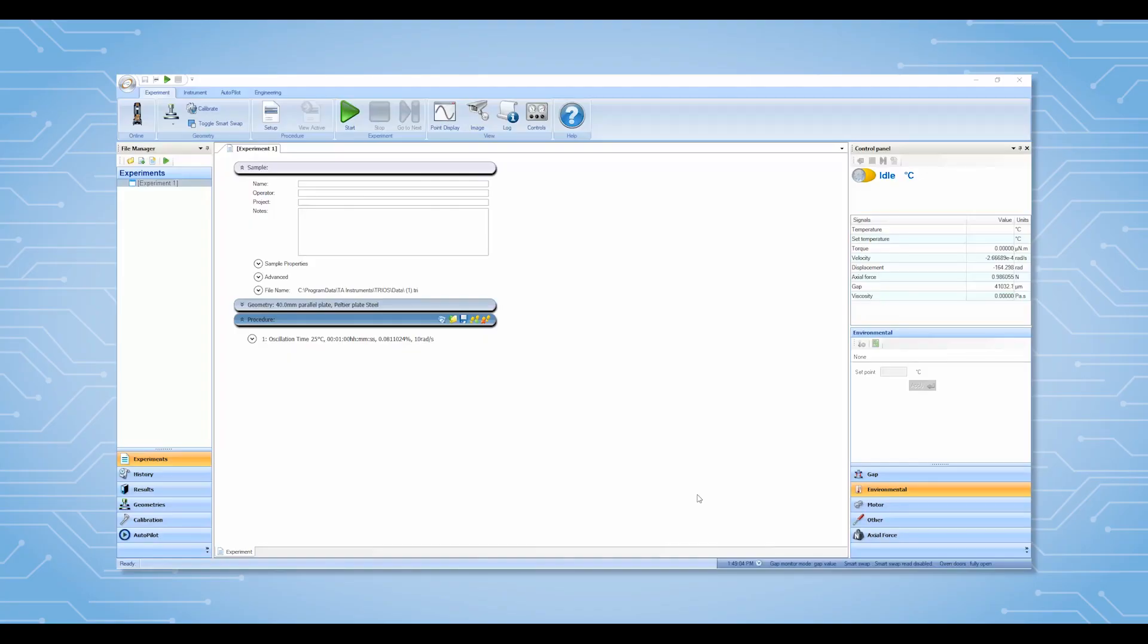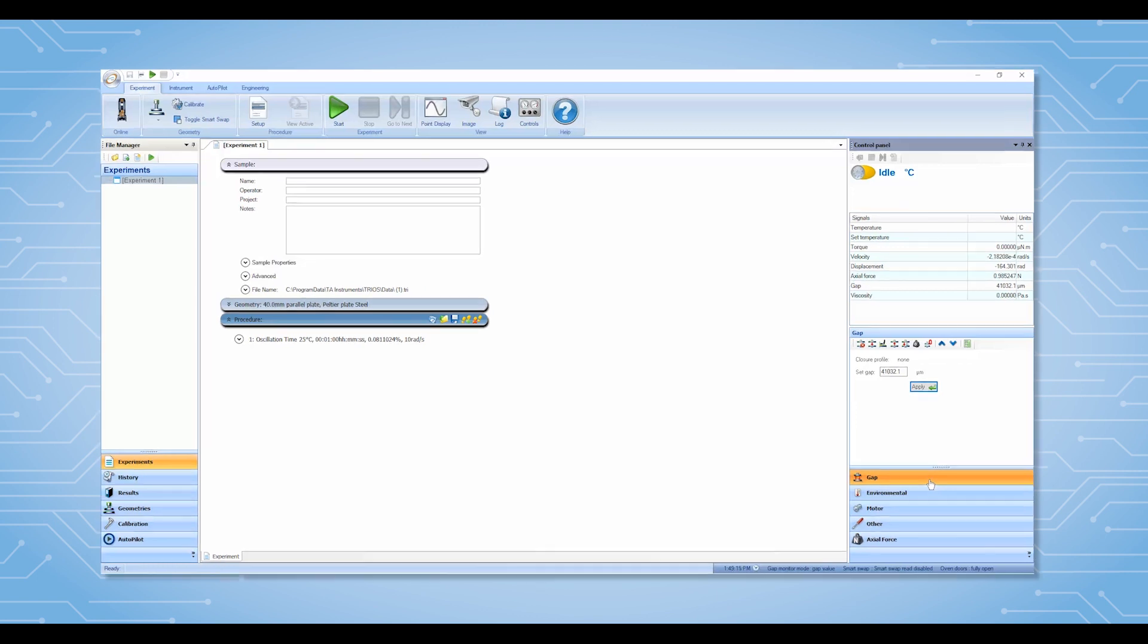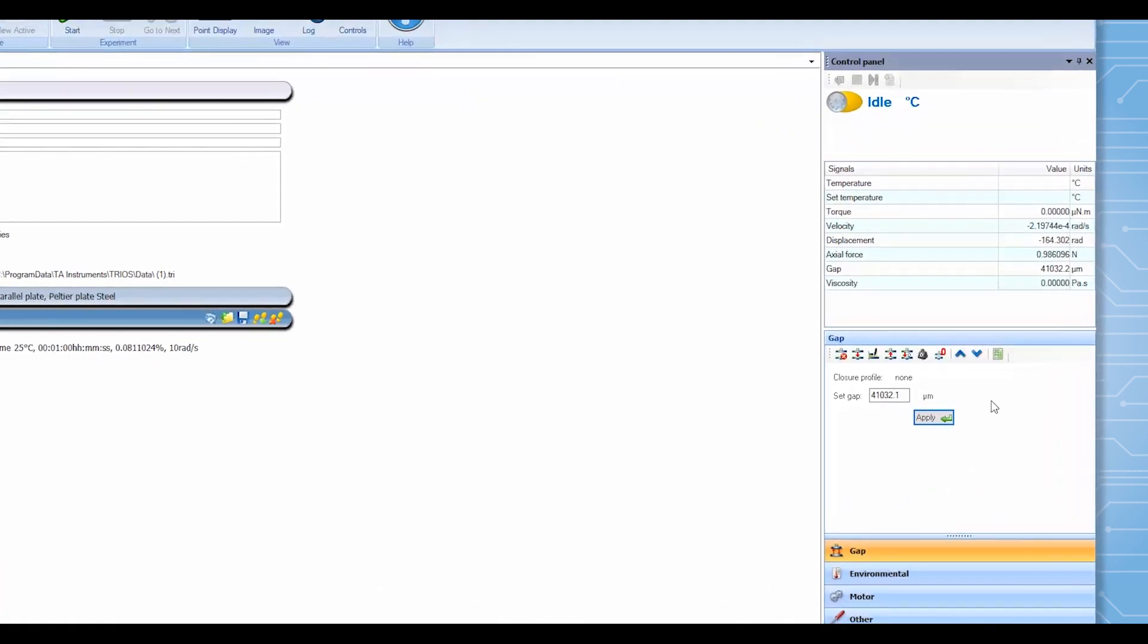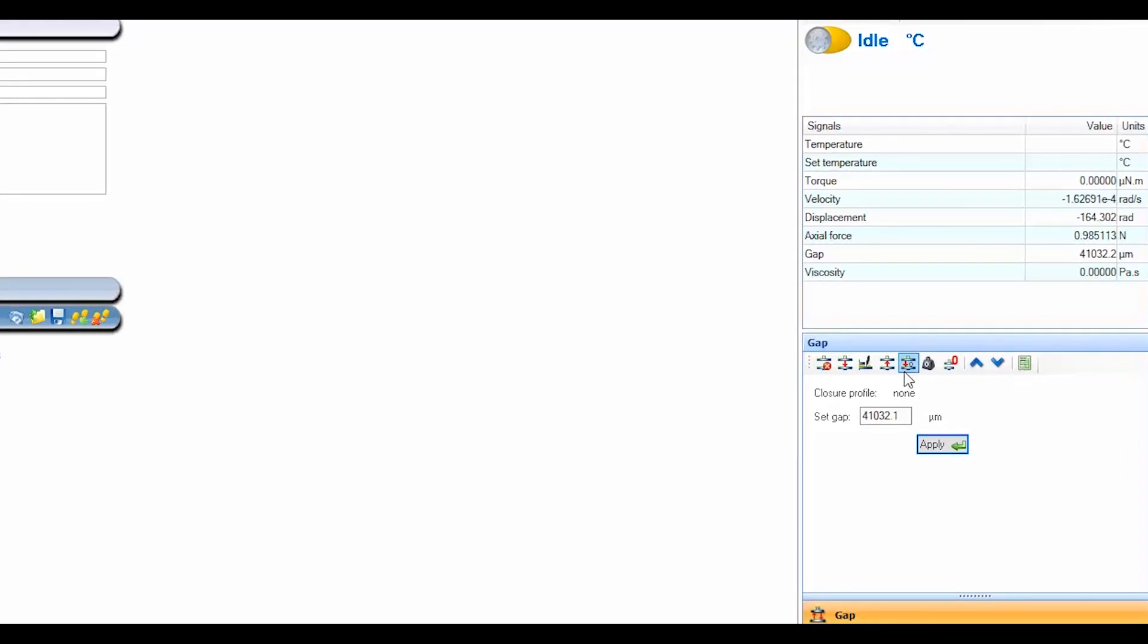Alternatively, sample loading can be performed through TRIO software control. From the bottom of the control panel, click on the gap bar to access all of the gap setting functions. When moving your mouse cursor to each icon, TRIO software will pop out a window indicating the function of this icon.